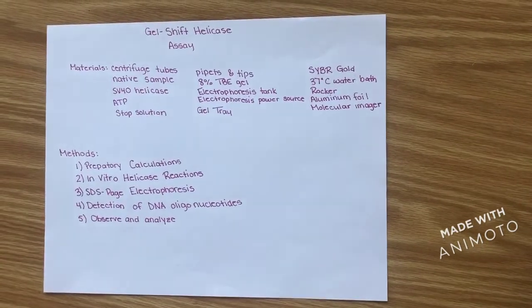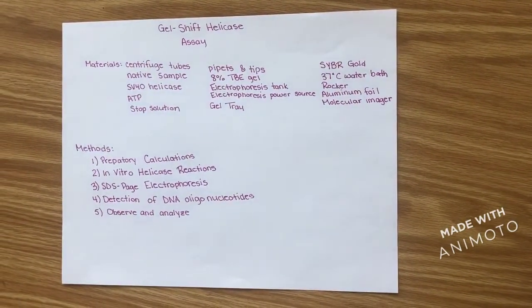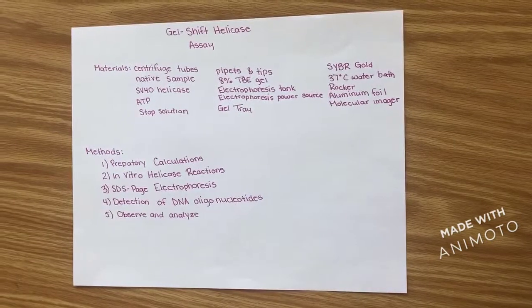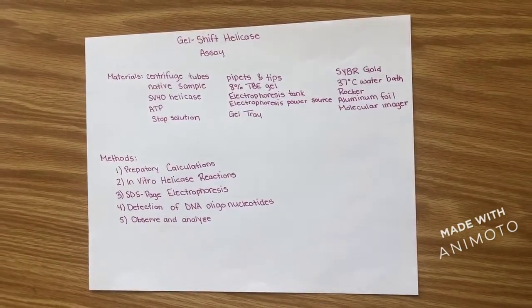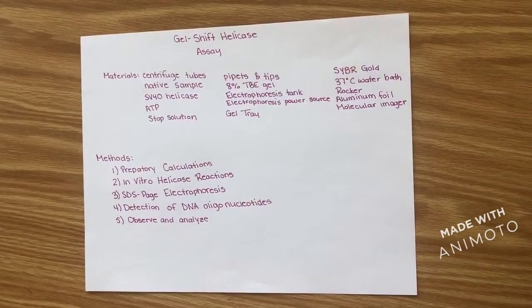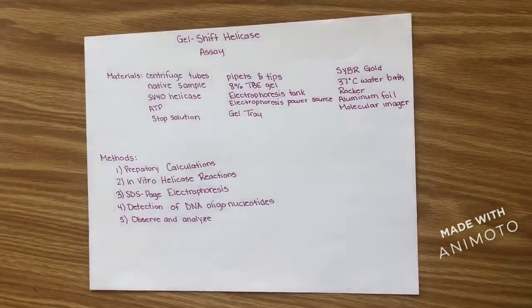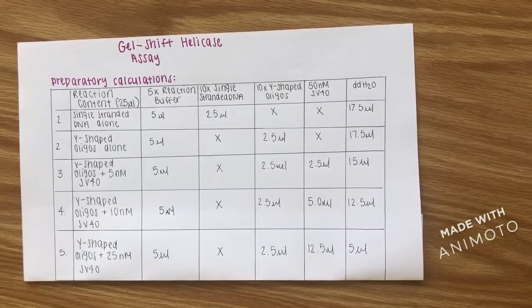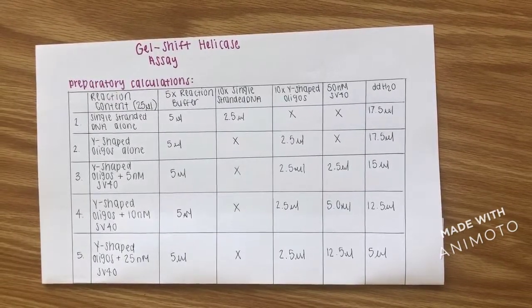Materials required for a gel-shift helicase assay are listed. In order to perform a gel-shift helicase assay, you must make preparatory calculations, perform in vitro helicase reactions, perform an SDS-PAGE electrophoresis, detect DNA oligonucleotides, observe and analyze bands. The calculations were done based off the necessary volume of each tube. The calculations are listed in the table.